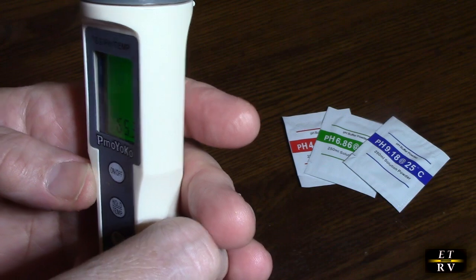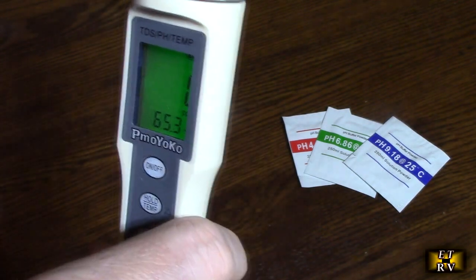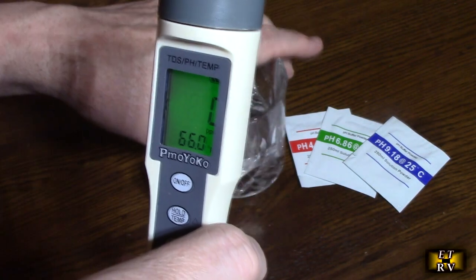So the parts per million is excellent if you have a water filter, which I do. So I'm just going to give you an example right here.